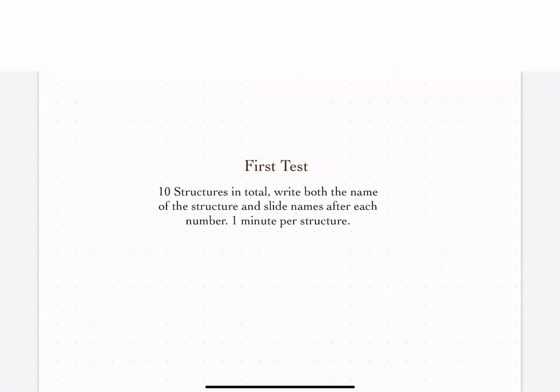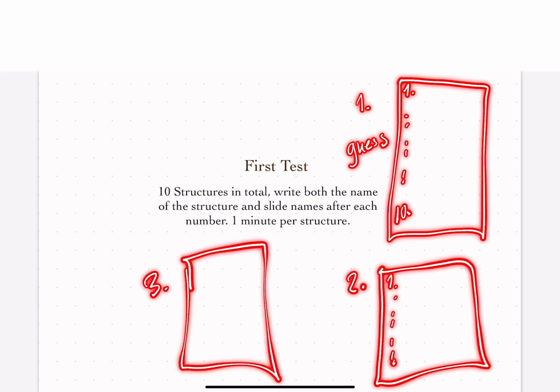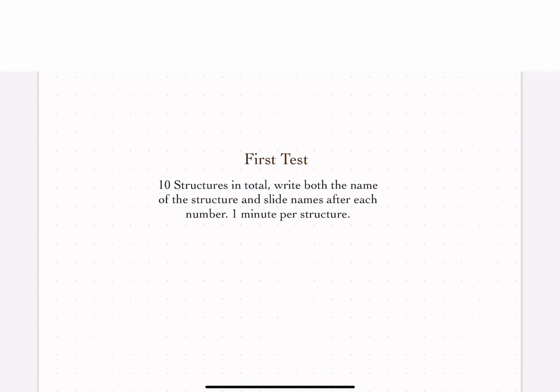I haven't. So again, stage 1 of the test would be going through all of the slides 1 through 10 without giving you the answers, letting you guess. That would be the guess stage. Stage 2 of the test is going through the answers but really quickly, whilst stage 3 of the test will be going through the answers but really in depth and showing you exactly what to look out for, which other structures are equally as important, etc. And this will all be done 4 times over. Please make sense. So, without any further ado, let's start the very first test.